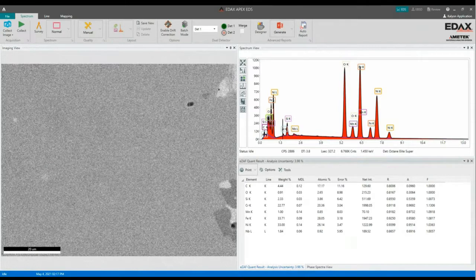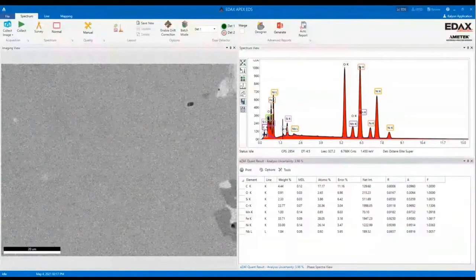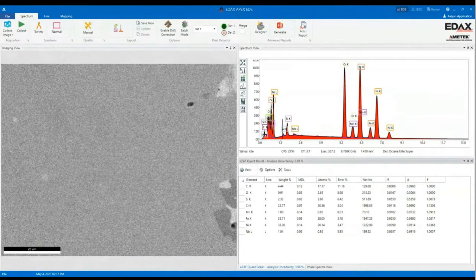choose the location where we want to save our Apex H5 files. Apex is using H5 for storing data because we have very large amounts of information. The H5 format satisfies our expectations, and for this reason we are using H5 files for the analysis or measurements we are storing. On the left in the box, we can select the tab language. We are able to use the software with 7 different languages.